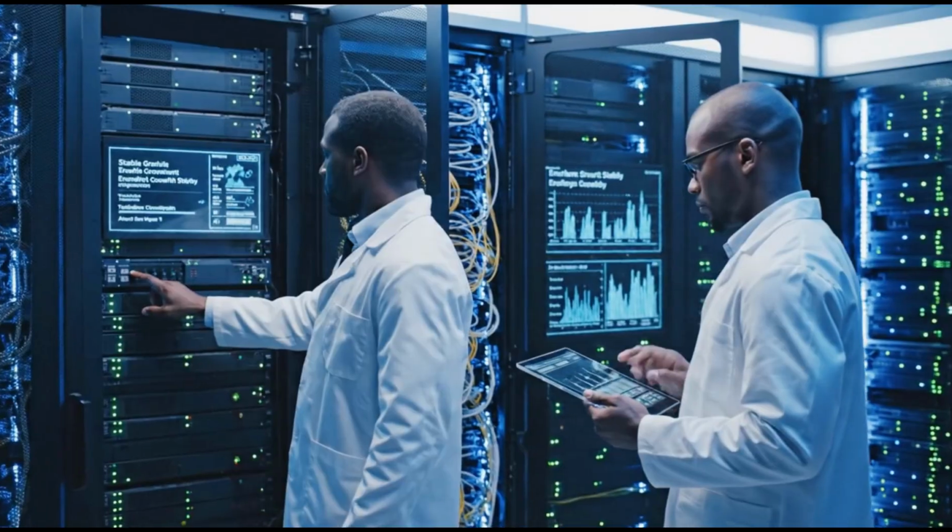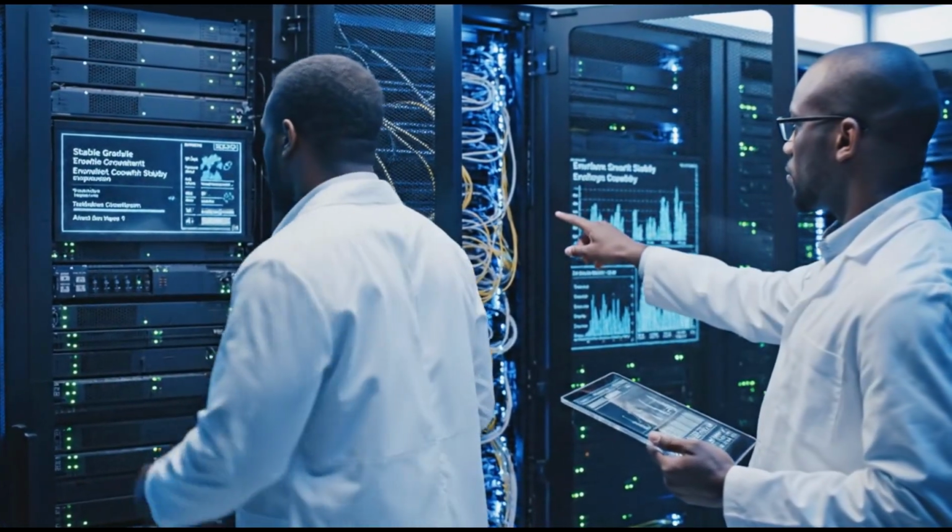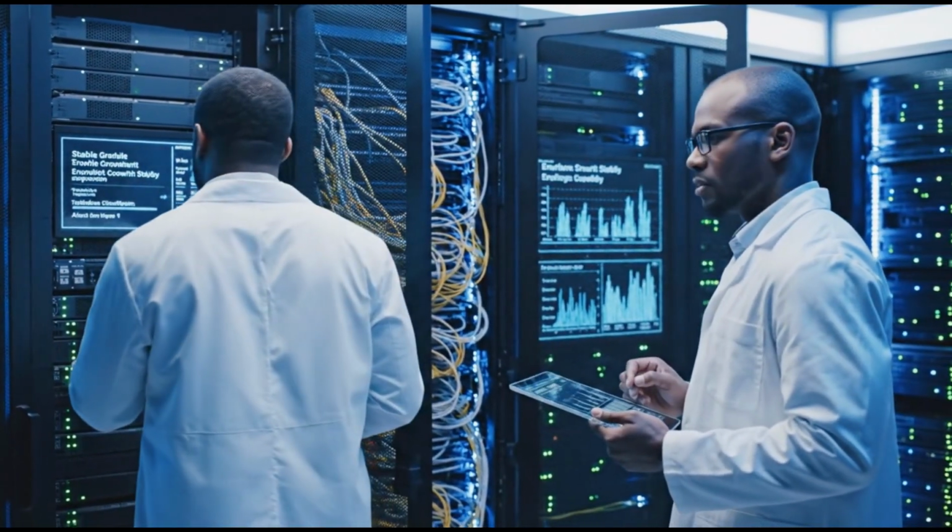Growth parameters stable across the board. Confirmed. Backup synchronization is active.